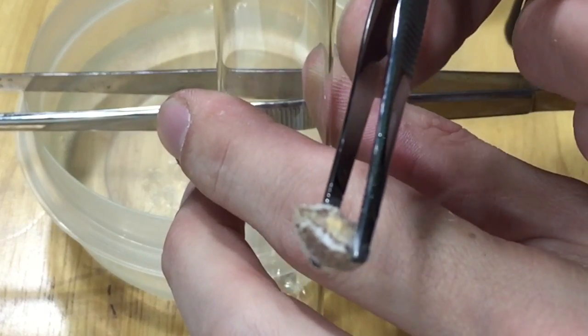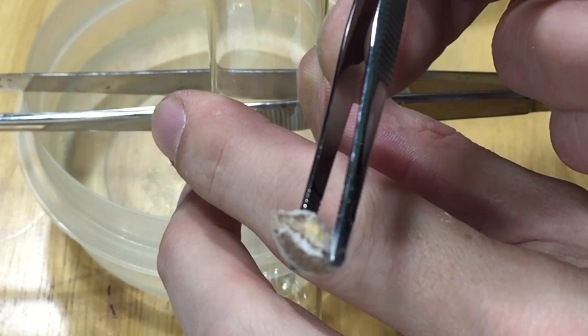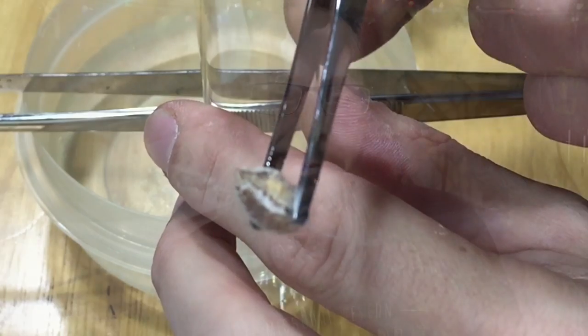What happens there is the carbon disulfide is capable of dissolving phosphorus. Now, phosphorus is super reactive with oxygen. When I pulled the little piece out of the bowl, you could see that it started smoking — that's the phosphorus reacting with oxygen just in the air and creating that wonderful smoky look. Very toxic, so you don't want to breathe it, but it looks really cool.